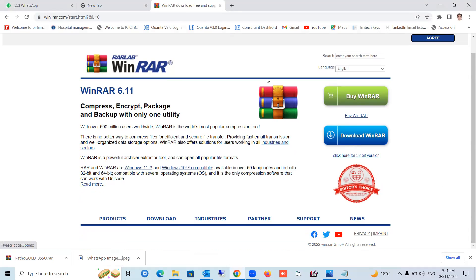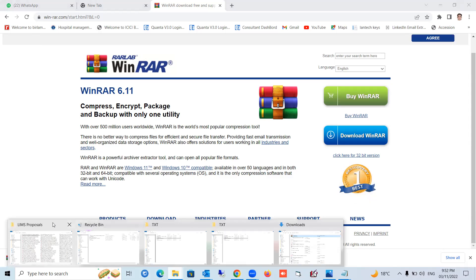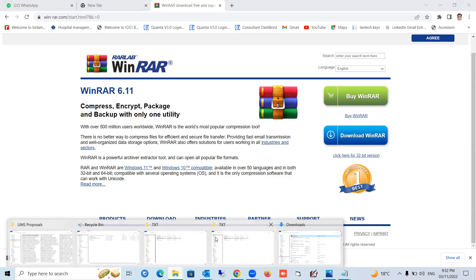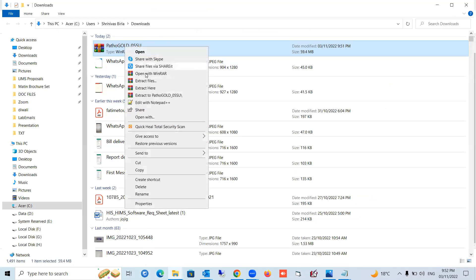First run and install WinRAR so that the WinRAR symbol appears on your downloaded file. Once you see the same symbol on the file in your download folder, right-click on it and select 'Extract Here'. Press 'Extract Here'.